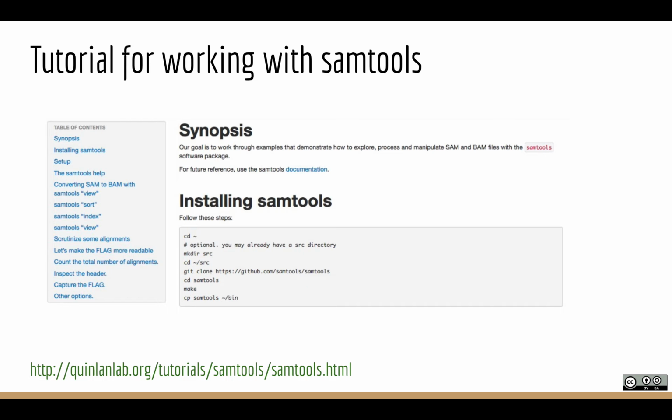Typically what you want to do is you do your sequencing experiment, you convert all the data, you do the alignment, you convert the data to BAM format, and you quickly want to be able to get that up into IGV or something and just look at the data. Did this experiment suck or was it good? And these steps really are the standard workflow for getting to that point. So that's one of the things we're going to have you do.